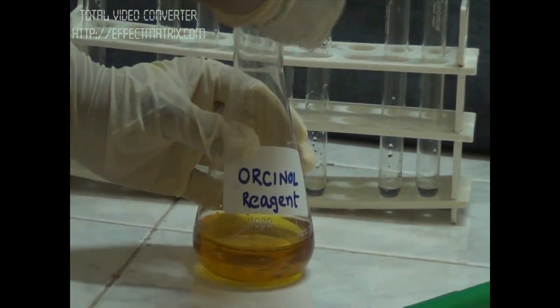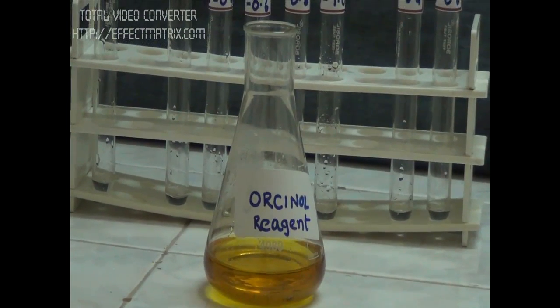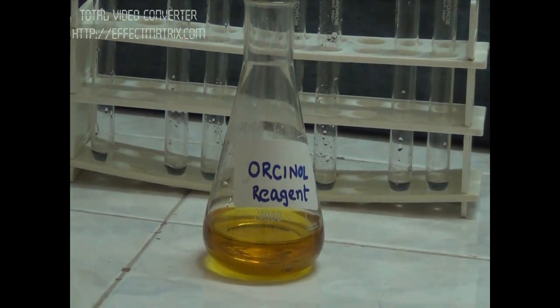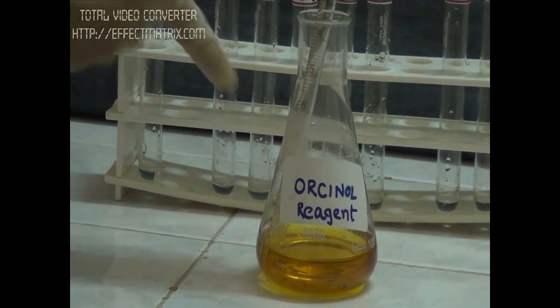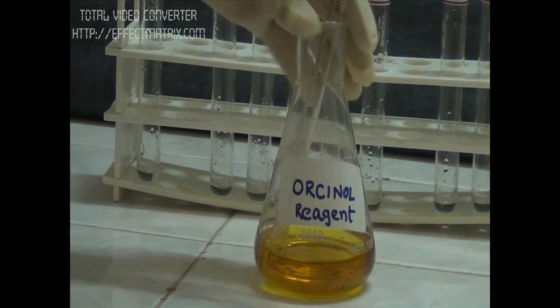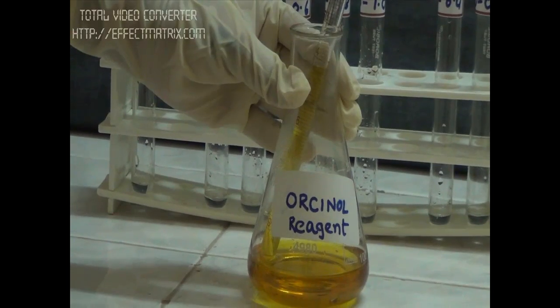The concept is that ribose sugar, in very acidic conditions, gets converted to furfural, which then reacts with our reagent, orcinol. And it gives a green color complex at 665 nm.